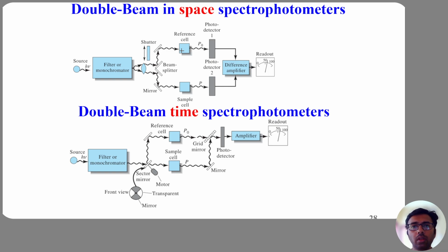To overcome this limitation, optical physicists developed double beam spectrophotometers. The key idea is elegant. Instead of measuring sequentially, we measure reference and sample simultaneously or nearly simultaneously. The incident light is divided into two optical paths. This allows continuous comparison between the analyte and the reference blank.